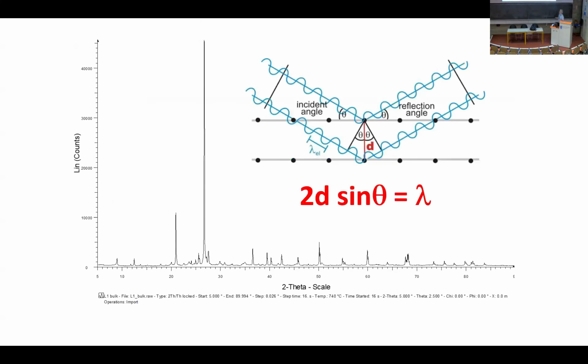So this is how we measure this information, and the information we will extract. This is a typical diffraction pattern we can record on a soil sample, in this case, if I remember correctly. And you have diffraction peaks at different angles. All these intensities measured at different angles correspond to different d values, and all these d values are periodicities that are present in the sample.